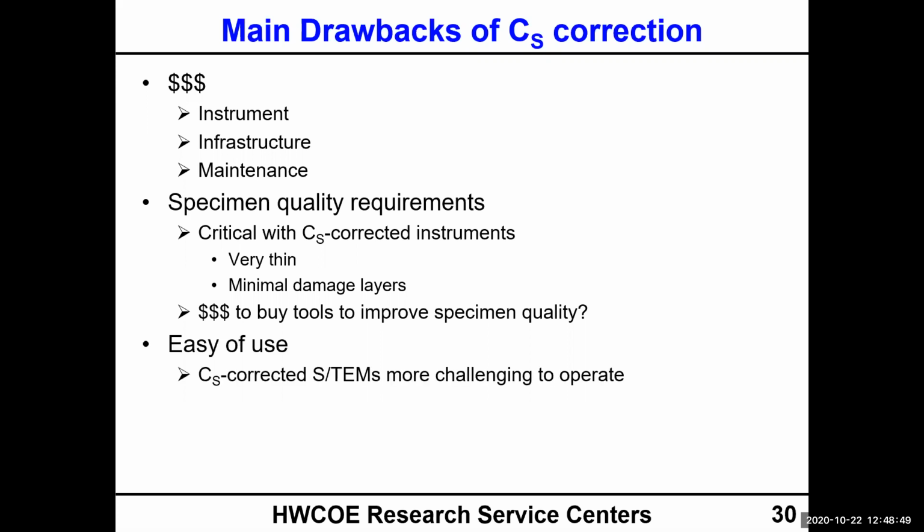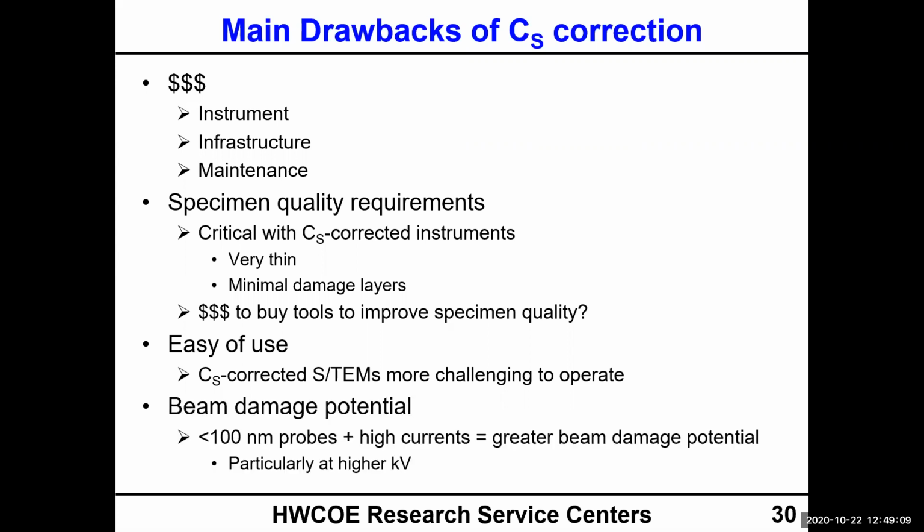Ease of use. Having spent many hours with a CS corrected STEM, I can tell you from experience, they are more challenging to operate. As a general rule, anytime you increase a system's performance, it's going to be more challenging to operate. So there is that to consider as well.